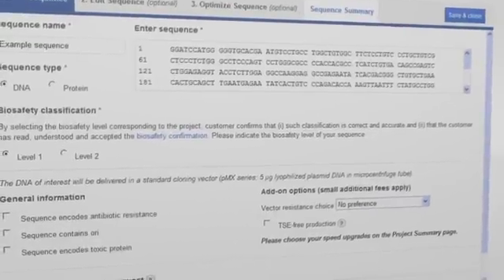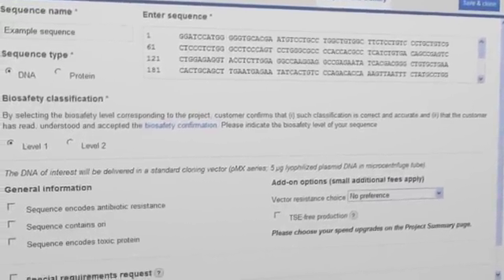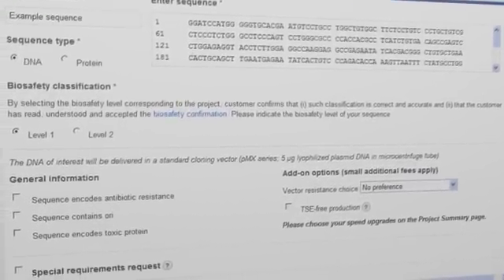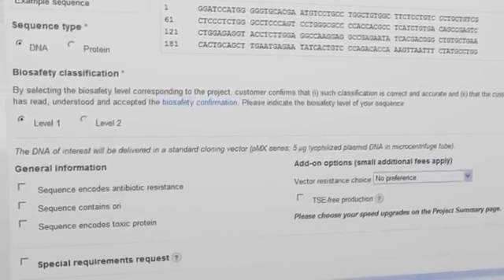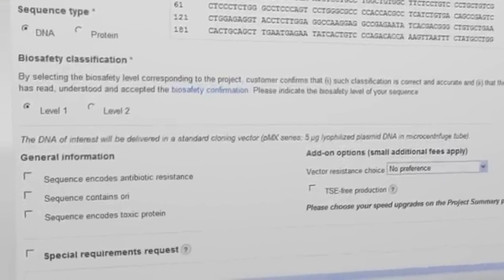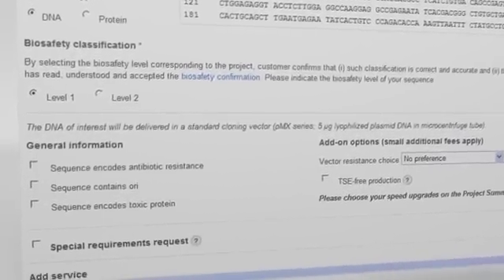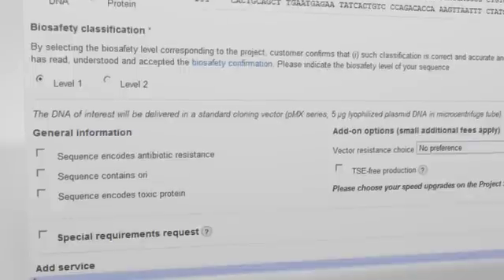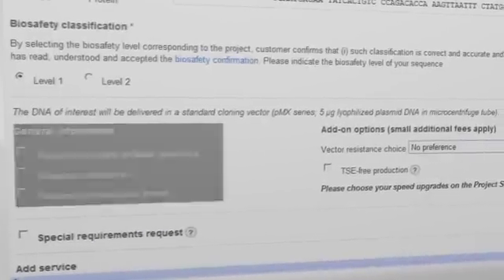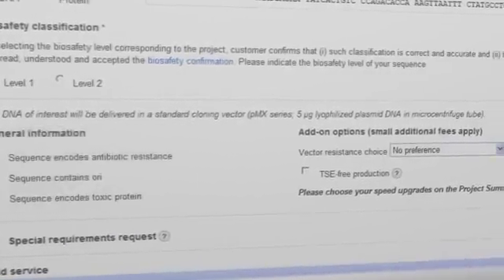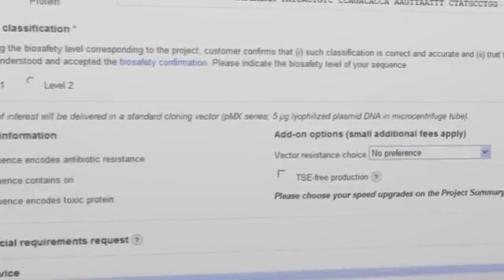The following options may also be interesting to you. The lower part of the form allows you to add general information about your sequence and select additional service options.